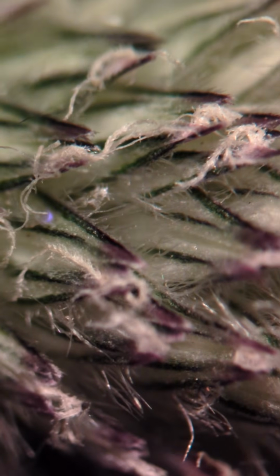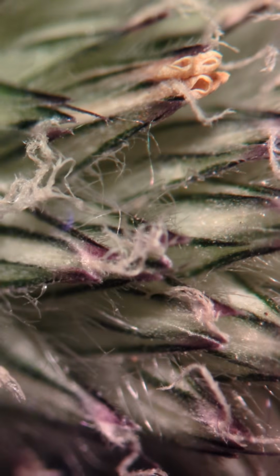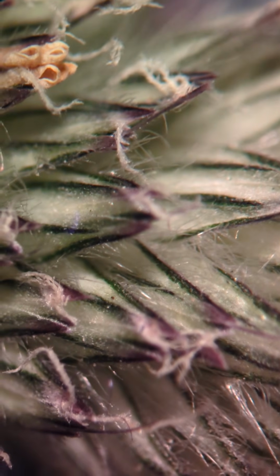Yes. And every single one is technically a flower. So you probably have reproductive bits in each one of those. And if I had to hazard a guess, I'd say there's little fuzz on there so that it'll actually take flight a little bit and move some distance.